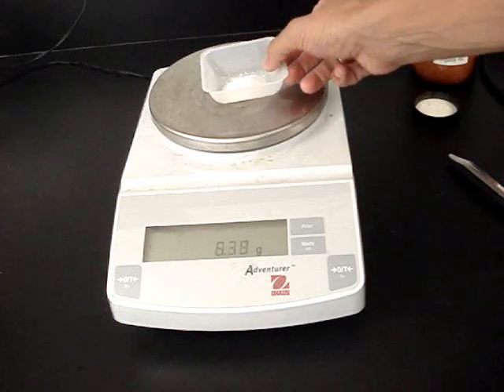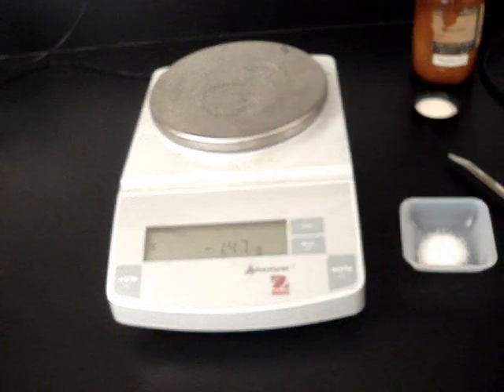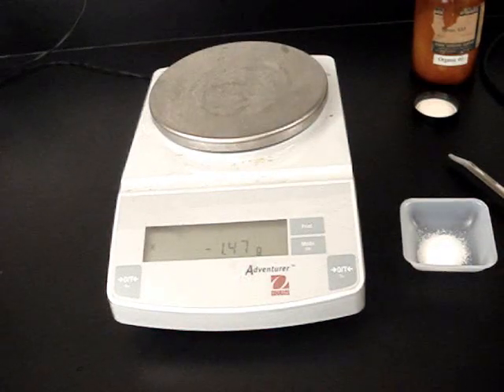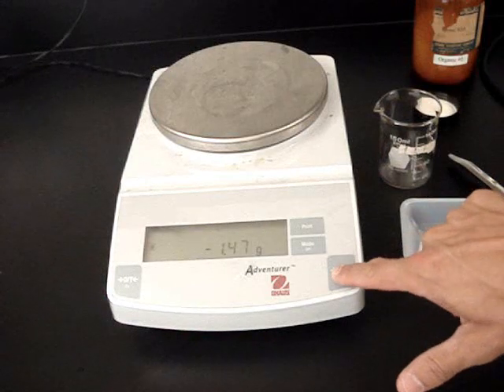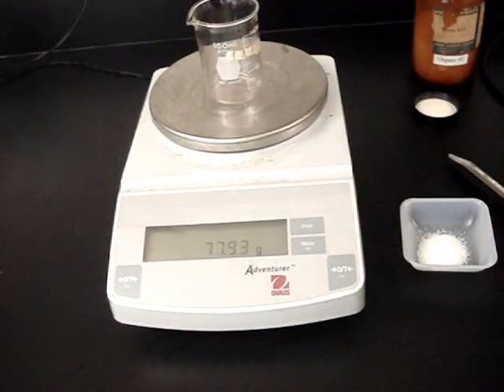So the big thing to remember when you're using the balance is you want the balance to say zero before you put whatever you're measuring. So if I want to measure the beaker, I want to hit zero first. Now I put the beaker on. Now that's the mass of the beaker.